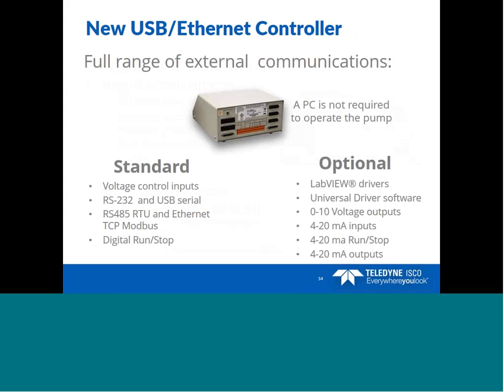The controller also has a full range of external communications. Standard are 0 to 10 volt inputs. We have RS-232 and USB for serial communications, RS-485, RTU, and Ethernet TCP Modbus, and digital run and stop. For options, we have LabVIEW drivers. We also have a universal driver if you're developing your own software. We have 0 to 10 volt outputs and 4 to 20 milliamp inputs and outputs.